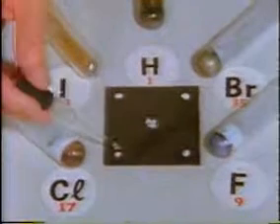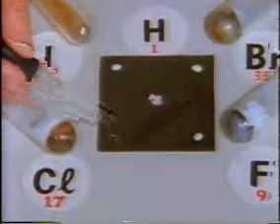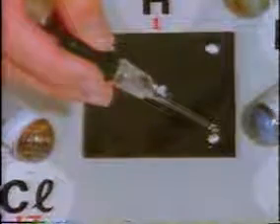We remove some of the potassium iodide and the other 4 products and check their reactivity with water. The chlorine compound dissolves quietly. So does the fluorine compound.